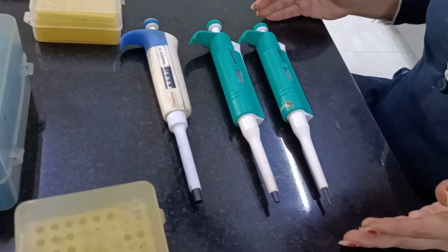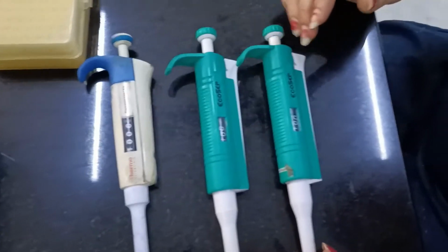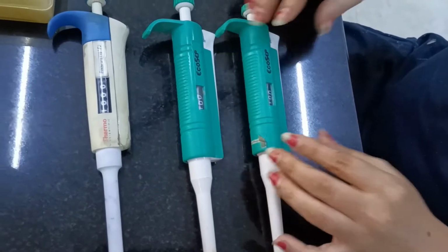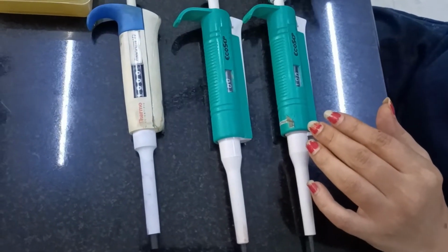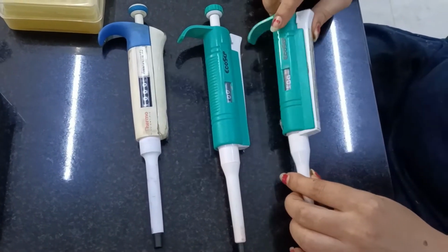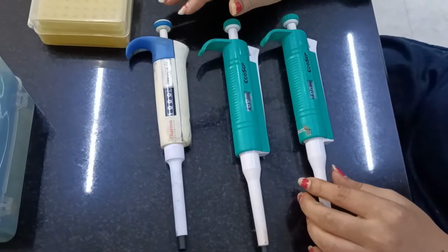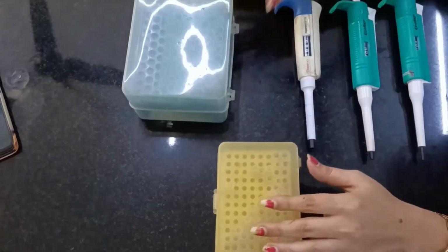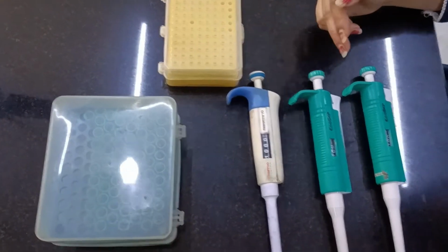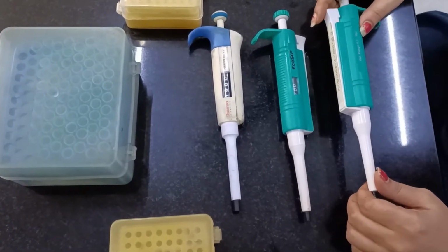There are three different kinds of micropipette which have been placed over here. Each one differs with respect to the volume, how much volume of liquid they can take in and how much volume they can withdraw. So over here you can see different micropipettes which have been placed. Along with that, there are different micro tips which are available with respect to a particular volume which have been selected over here. So we are going to study how to hold the micropipette.